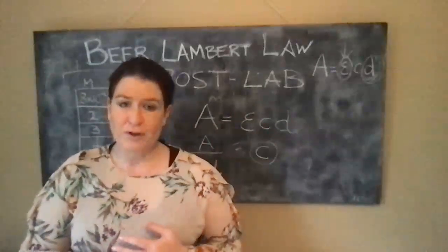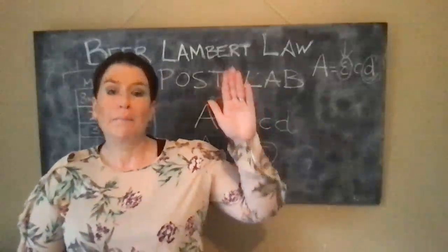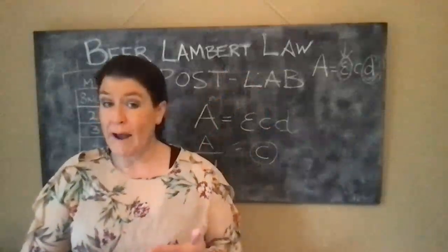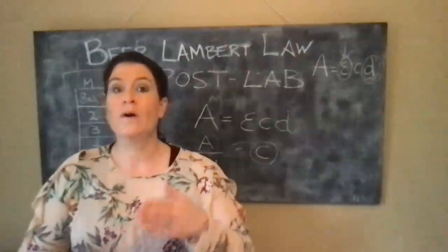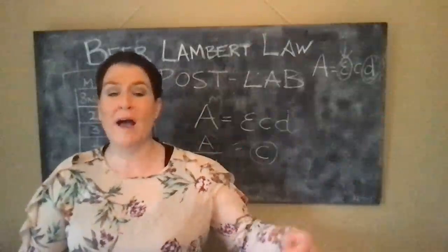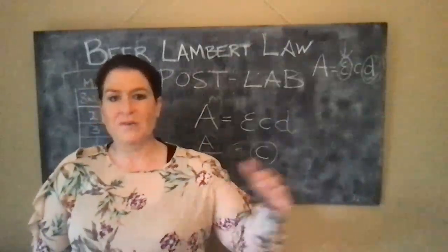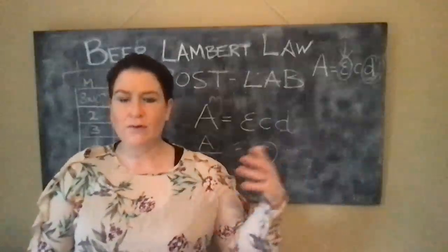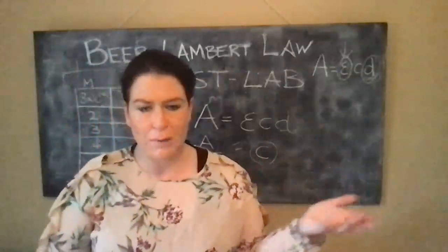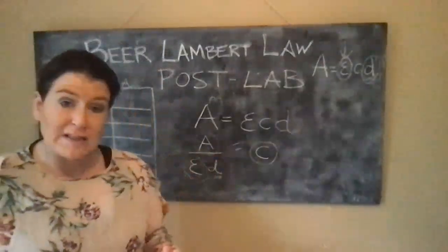A little bit of introduction on what you understand the Beer-Lambert law to be. Procedure: how you made up your solutions, written in the correct way. So such and such was done, a solution was made, the absorbance was read by the spectrophotometer, and so forth. The data was collated. A graph was created, and its slope was determined, and so forth. Then after that, your results need to be presented.